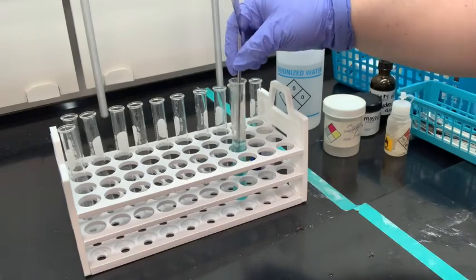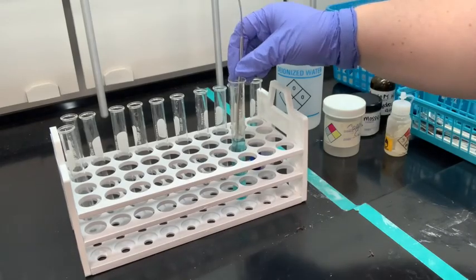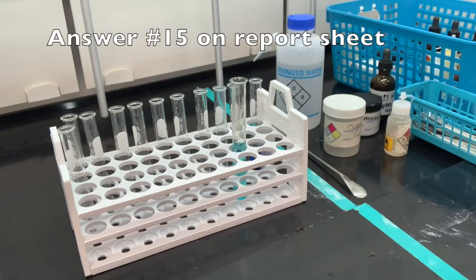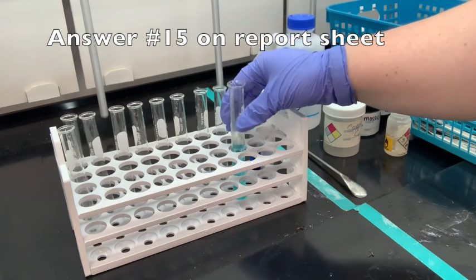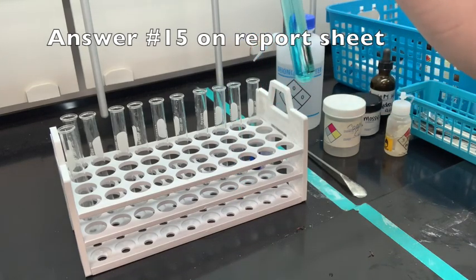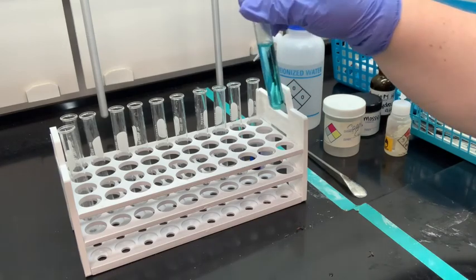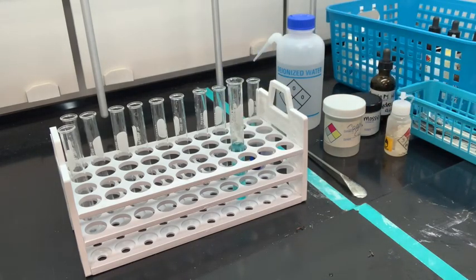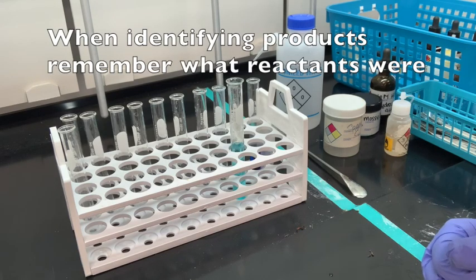So here I'm just adding some distilled water to this so we can look at the solution, the other product that was made in this reaction between copper and nitric acid. Okay, so we have a blue solution, a light blue solution. So you want to be able to identify what this solution is, again, using that table on page 58. When you're trying to identify the products, you can use the table on page 58. You also want to think about what your reactants were.